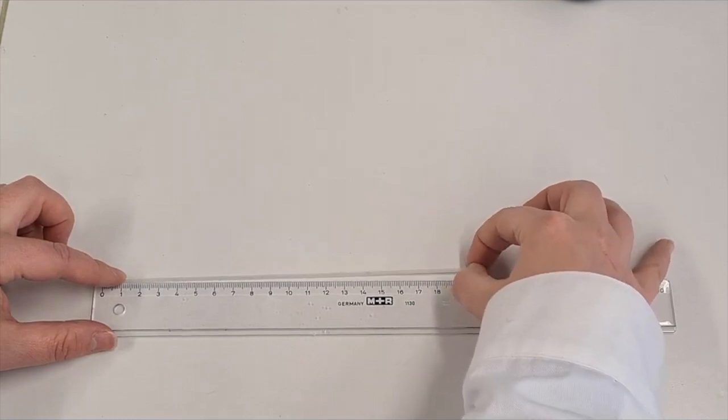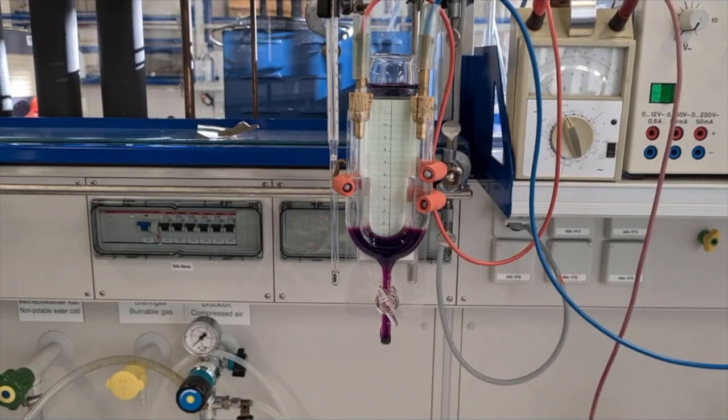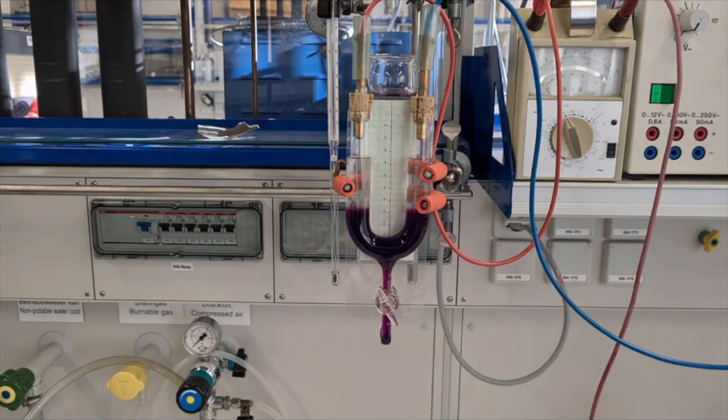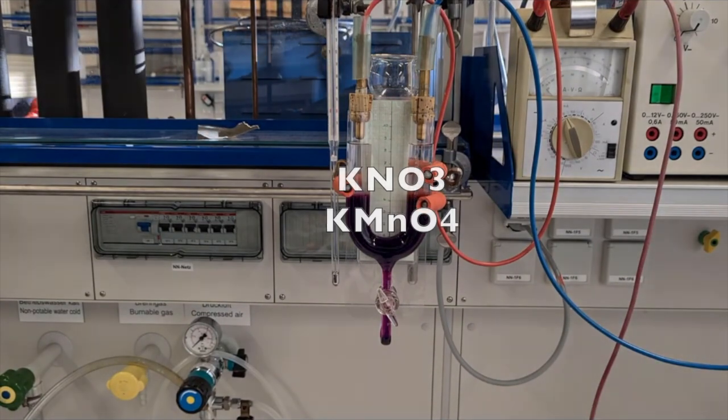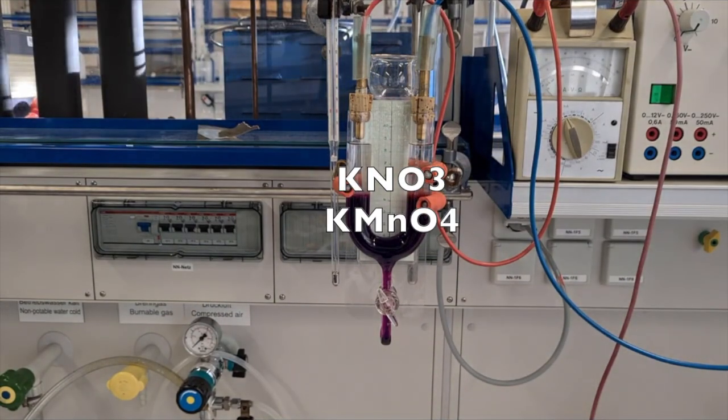Then, potassium permanganate solution is allowed to rise under the potassium nitrate solution by carefully opening the stopcock until the electrodes are immersed.